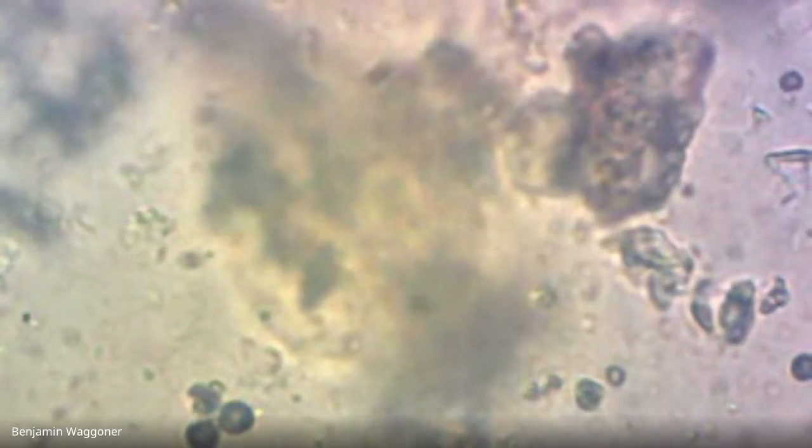With a little practice, you can tell the difference. A lot of this twitching is just Brownian motion. I'm going to invoke a slightly lower power, but there's definitely some small flagellates in there. So yeah, you can see that area of motion right there.